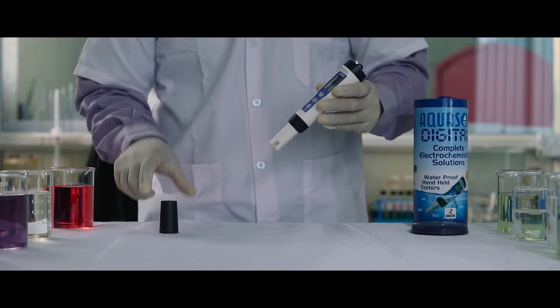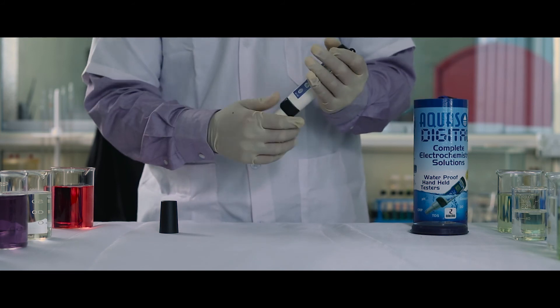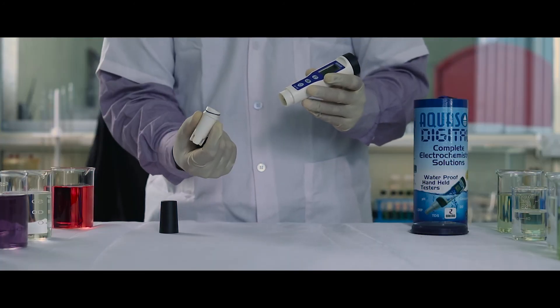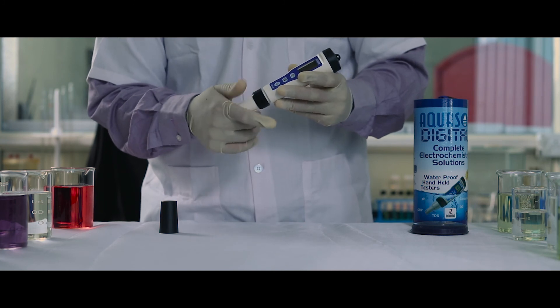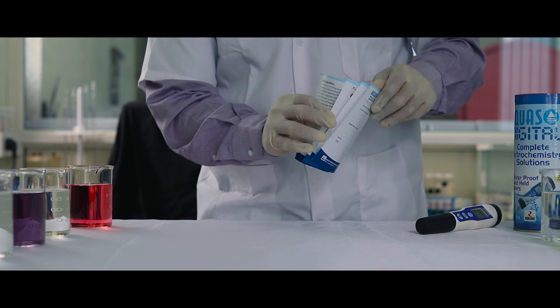To replace the electrode, remove the cap and unscrew the electrode holder and remove the electrode. Replace the electrode with the new one and screw the electrode holder back. For better understanding of this product, please refer to the instruction leaflet provided.